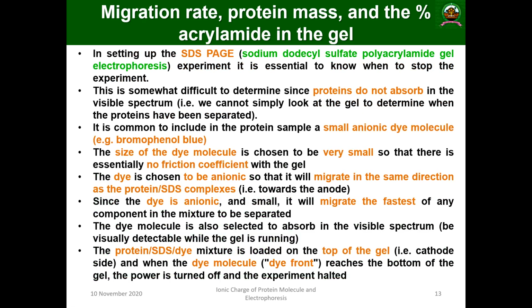And again, regarding the migration rate, protein mass and the percentage of acrylamide gel, when setting up SDS-PAGE, sodium dodecyl sulfate polyacrylamide gel electrophoresis, it is essential to know when to stop the experiment. This is somewhat difficult to determine since proteins do not absorb in the visible spectrum. We cannot simply look at the gel to determine whether the proteins have been separated or not. So the proteins will be moving through the gel, but we cannot simply see whether it is moving or not.